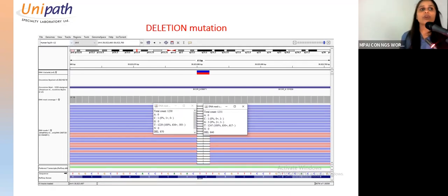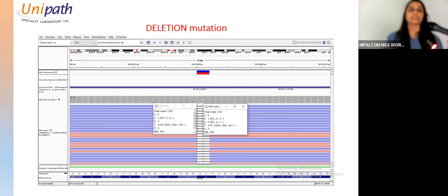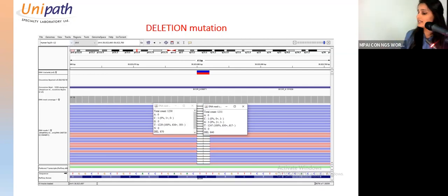Now, when you have predicted a pathogenic variant that matches the phenotype, and this also seems good on quality: if the quality is bad, you will see mutations, insertions, deletions here. That means the reads are of poor quality. But here, as you can see, these reads are so clean. So in quality terms also, it is good to go with. So you can report this variant now.